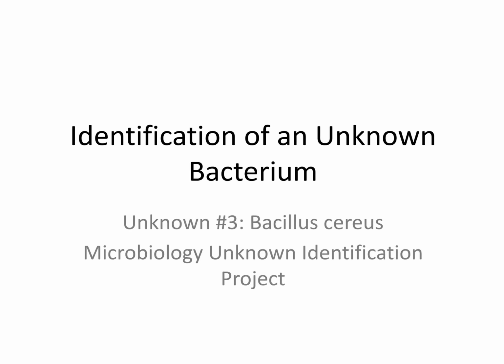Hello class, in this presentation I will explain how I identified my unknown organism as Bacillus cereus. I'll discuss why identifying unknown bacteria is important, the laboratory tests that were most useful, how the results led to the final identification, and why this organism is significant.